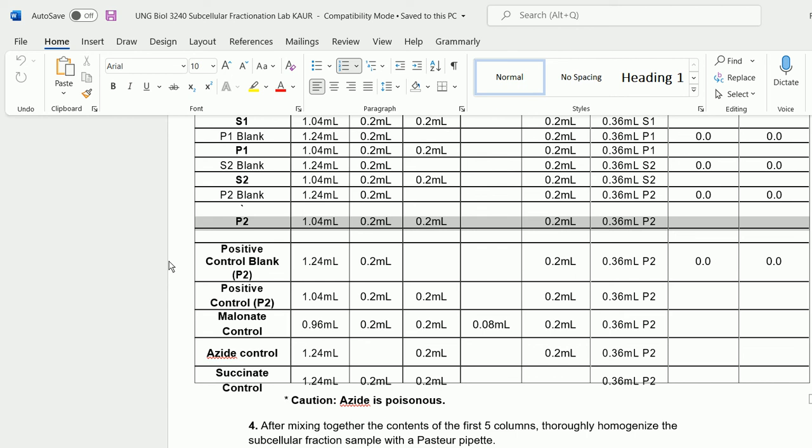So when you add malonate, malonate will go and bind to the active site. Succinate will not be able to bind. When succinate is not able to bind, you will not see the results, because the reaction catalyzed by this enzyme is the oxidation of succinate to fumarate. When succinate is not there, this reaction will not take place. So malonate is your negative control. You should see reduced reduction here.